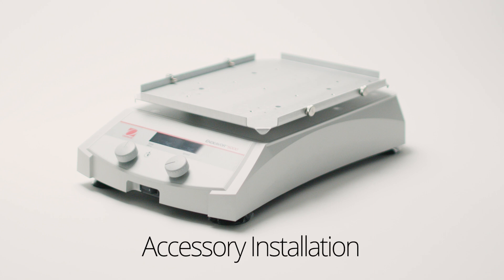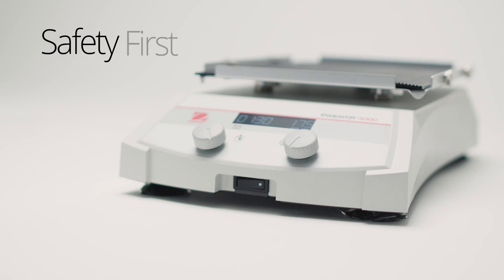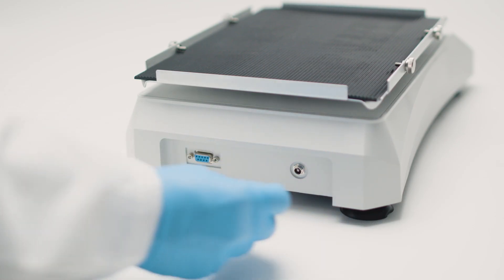In this video, we will cover various tray accessories to help you customize your shaking experience. Safety first — power down and unplug your shaker before installing accessories.